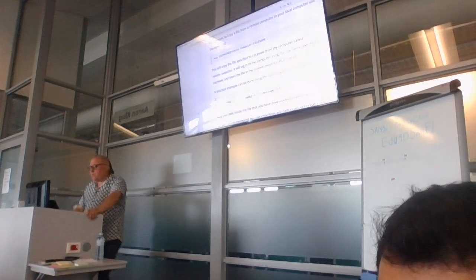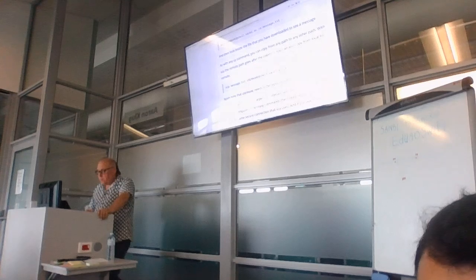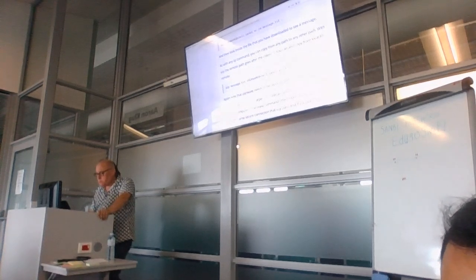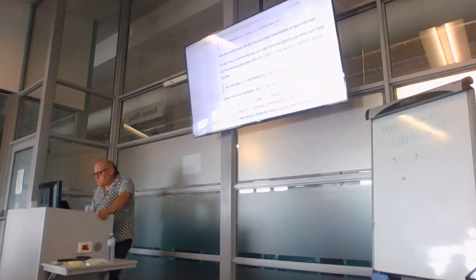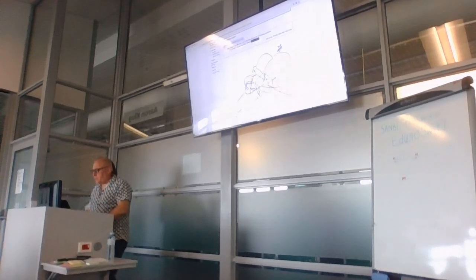There's a tool called Bandage that you can use to assess the shape of assemblies. Let me just find the picture. This is the wrong page. This page, where did it go?